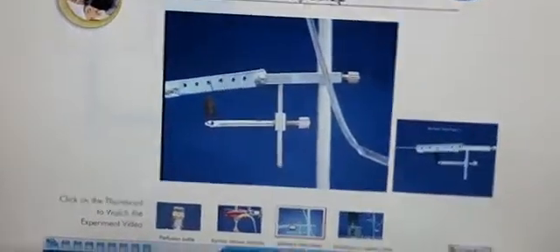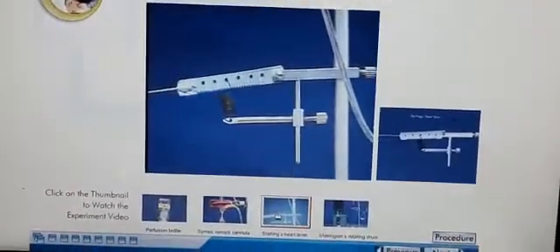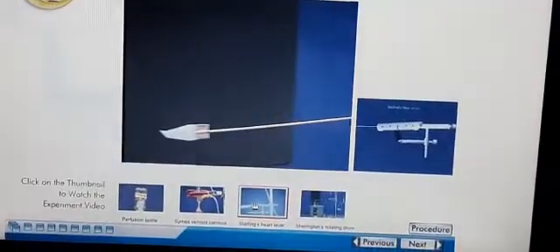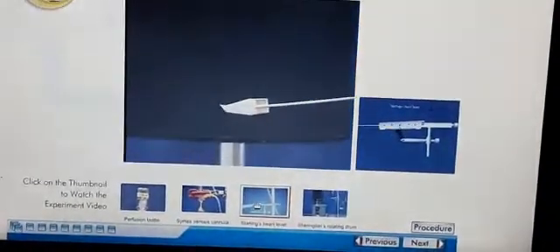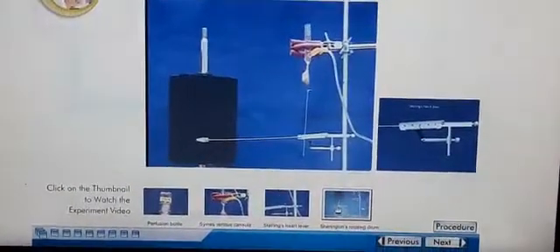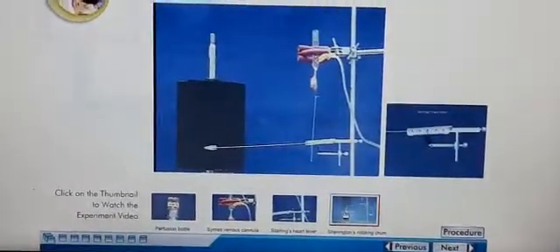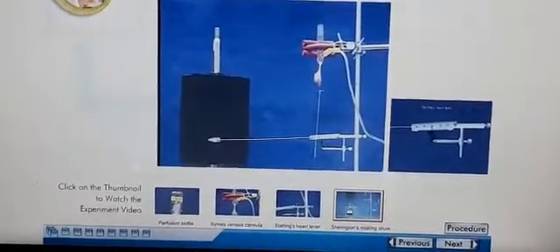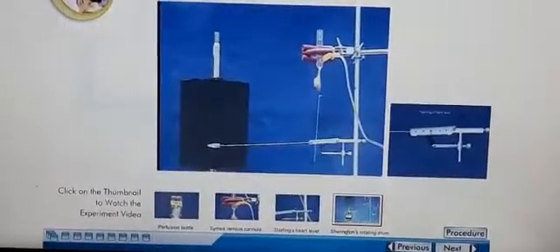Starling's heart lever is used to record the contractions of the heart. With the help of the tip of this lever, recording is done on smoked paper fixed on a circular cylinder. It is made up of stainless steel or light aluminium. The free limb of this lever is connected to the isolated heart with the help of a thread.